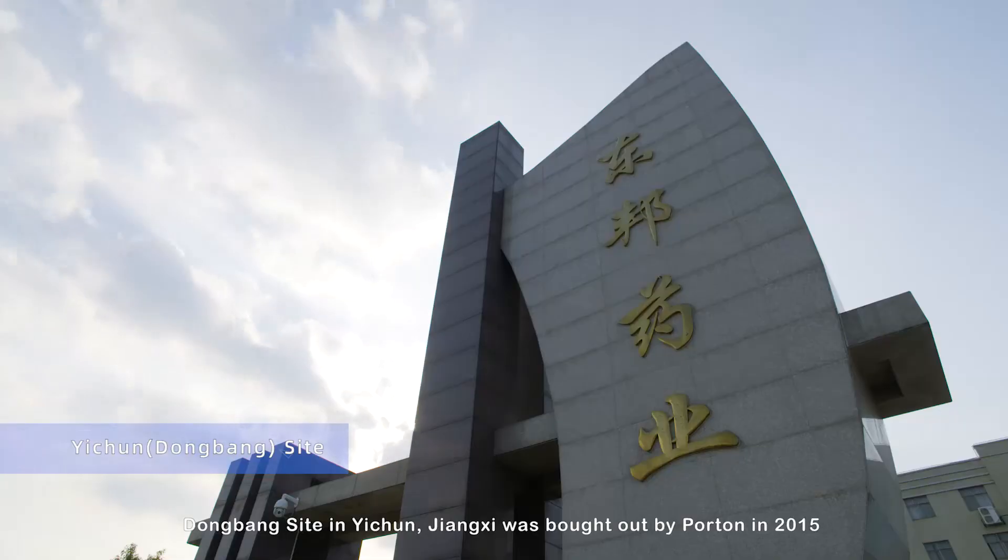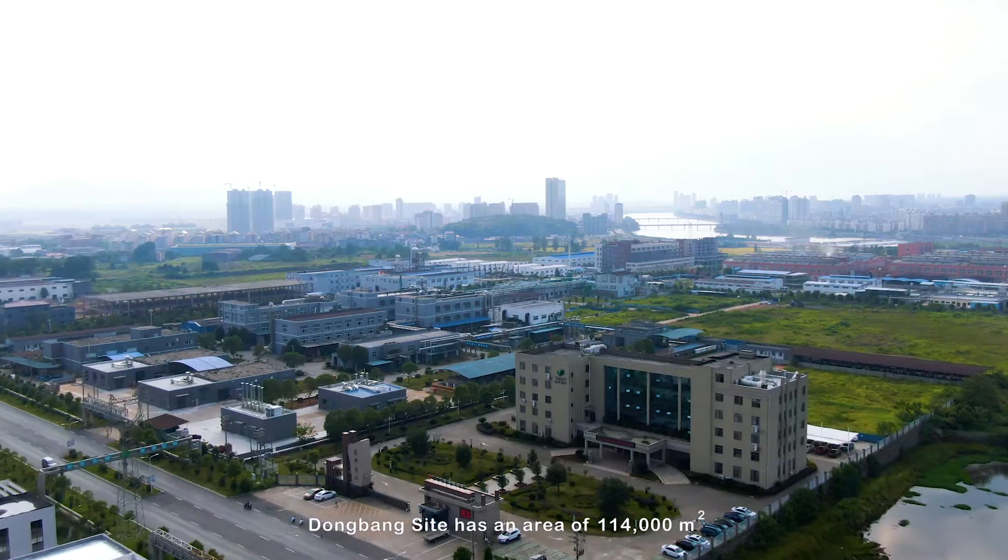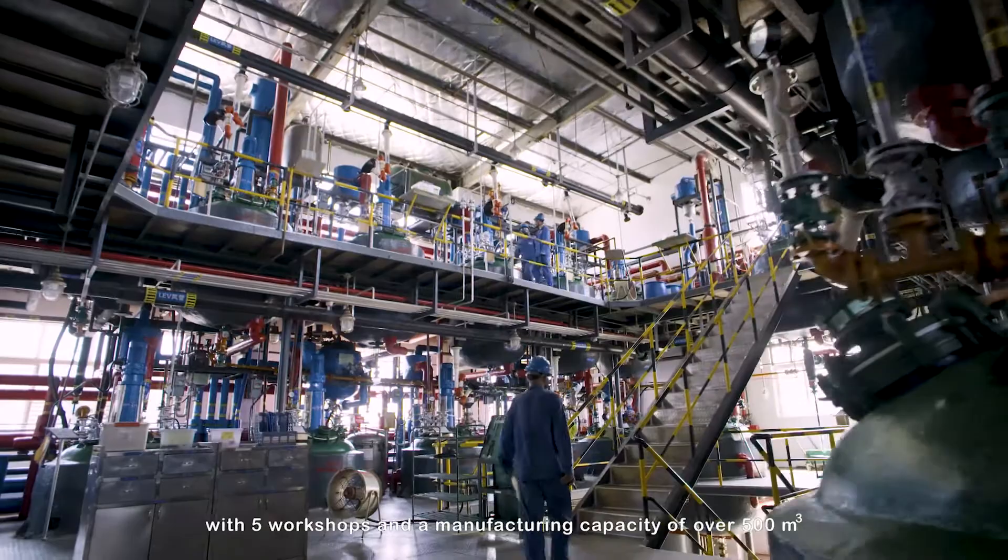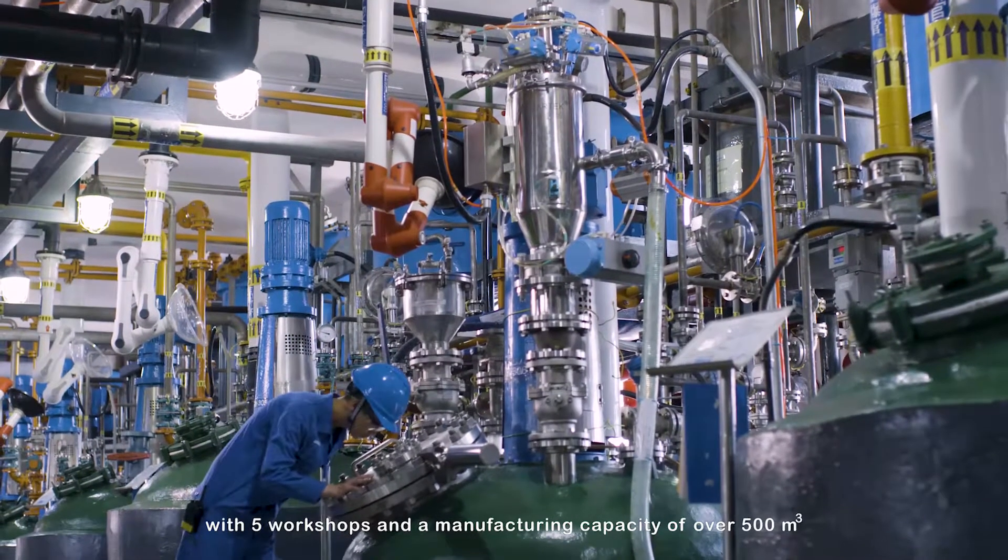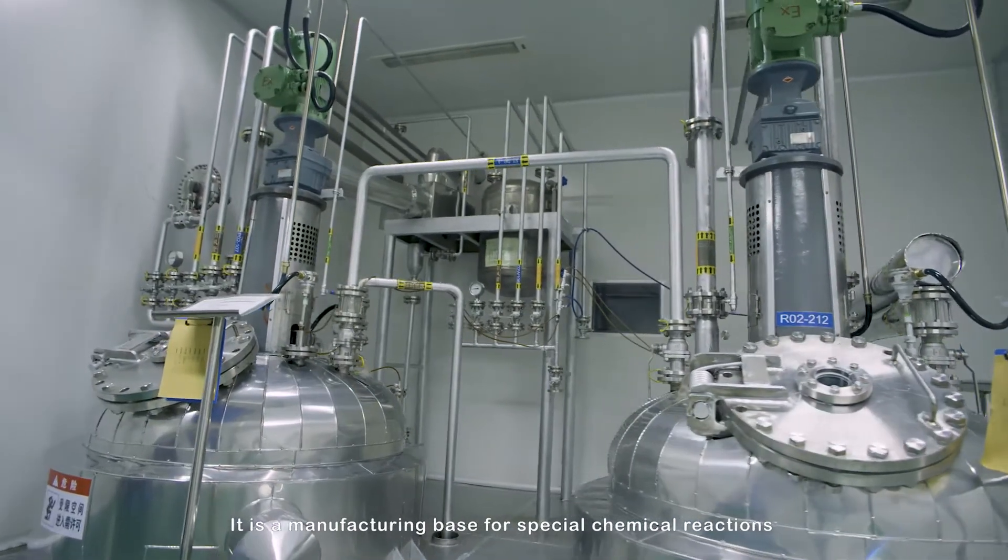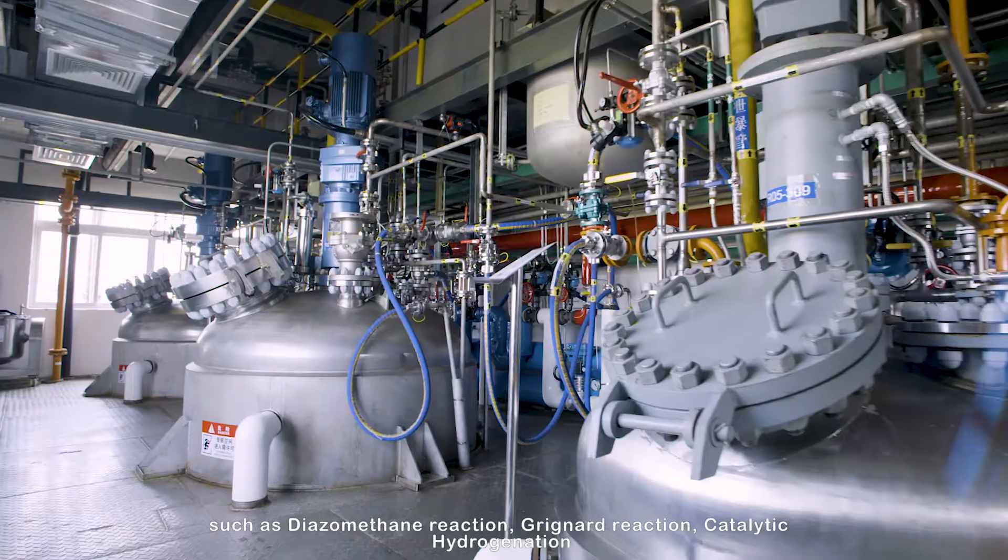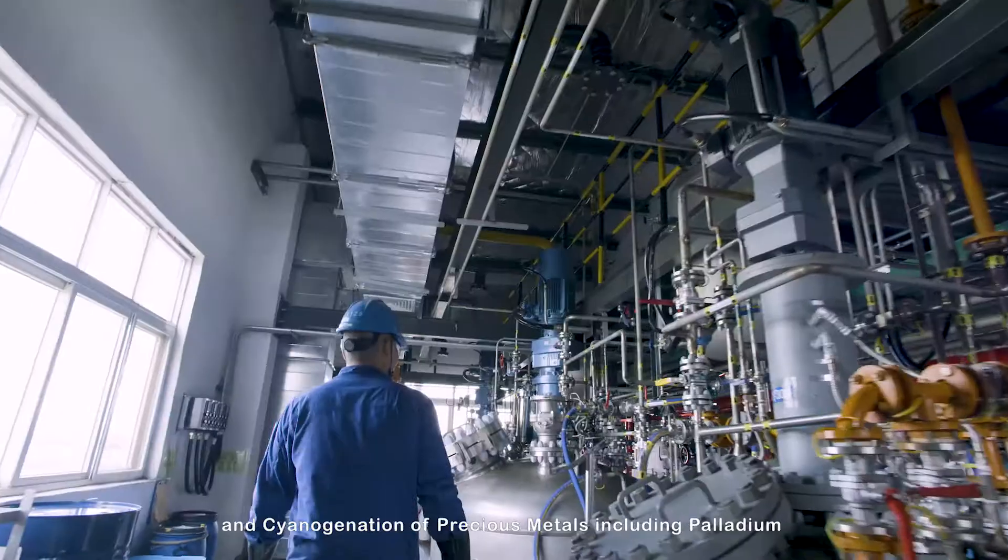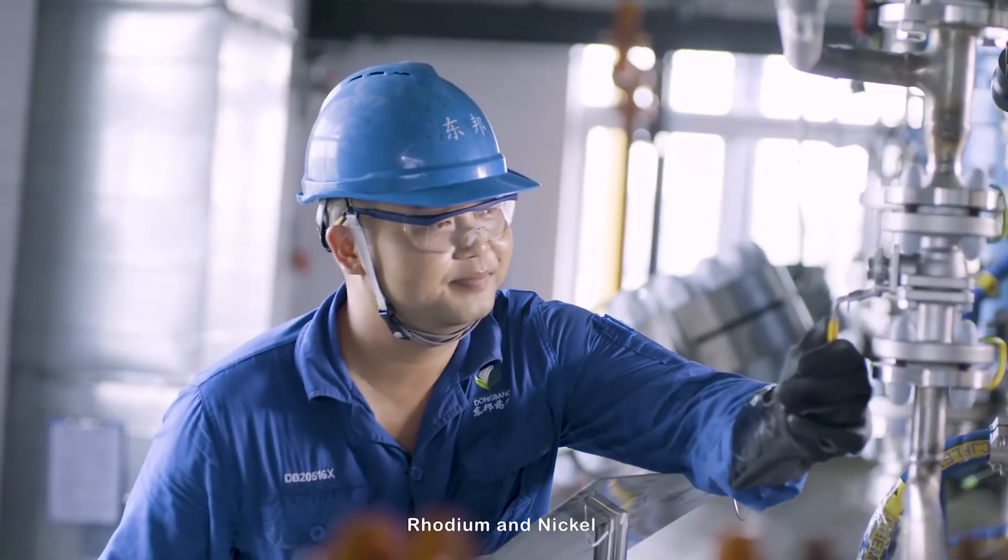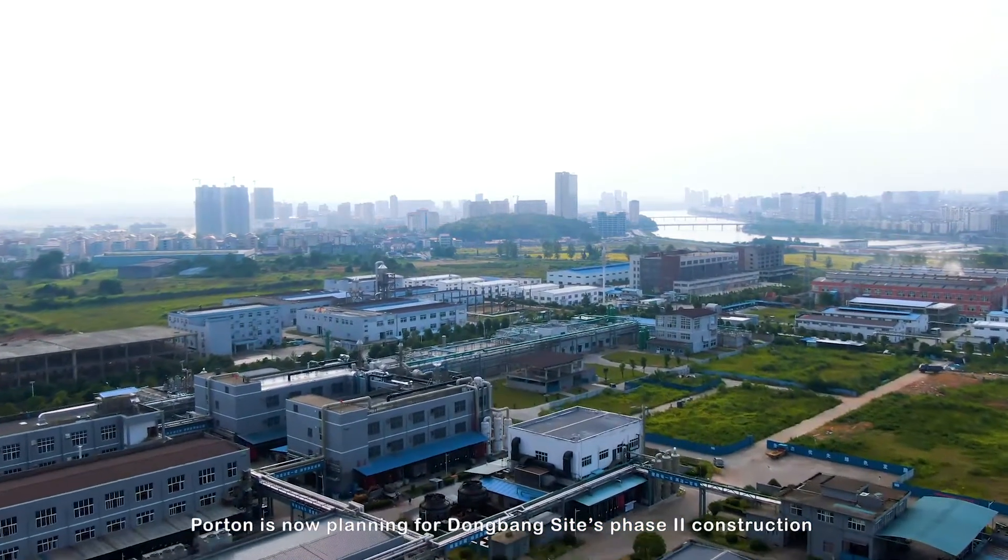Dongbang site in Yichun, Jiangxi was bought out by Porton in 2015. Dongbang site has an area of 114,000 square meters with 5 workshops and a manufacturing capacity of over 500 cubic meters. It is a manufacturing base for special chemical reactions, such as diazomethane reaction, Grignard reaction, catalytic hydrogenation and cyanogenation of precious metals including palladium, rhodium, and nickel. Porton is now planning for Dongbang site's Phase II construction.